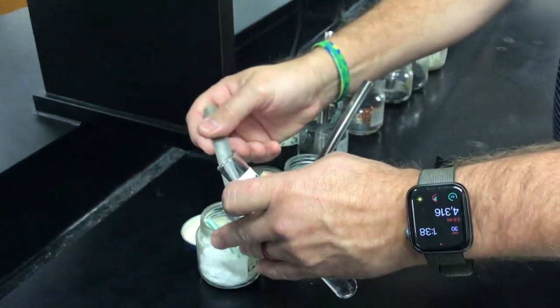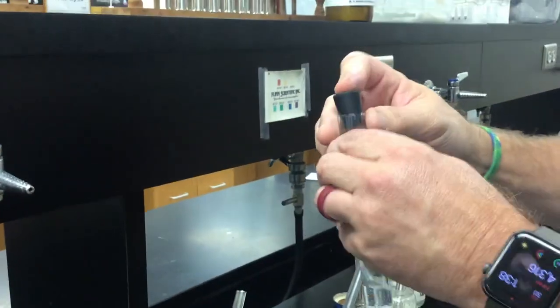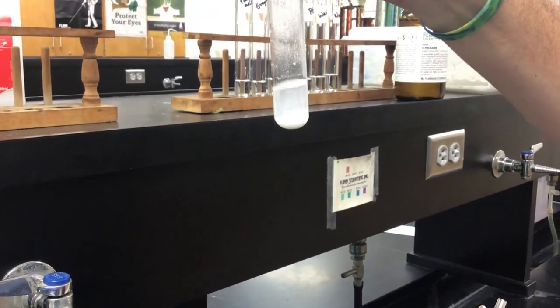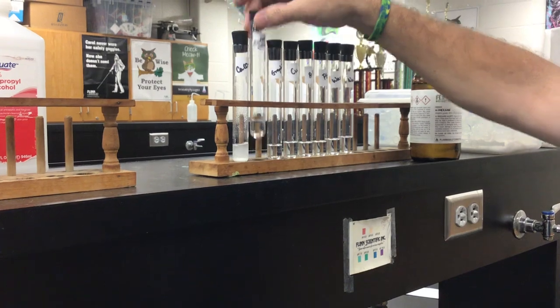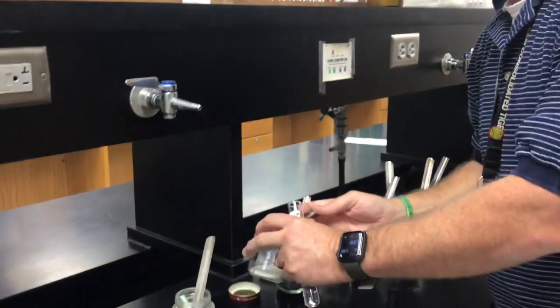So I'm going to put the calcium carbonate into the hexane, and we will shake that up a little bit. And again, we'll have to wait for this to either settle out or sit. You can kind of see what's happening already with that one. So there we go. And then the next one was tartaric acid. So I'll put a little tartaric in there too.